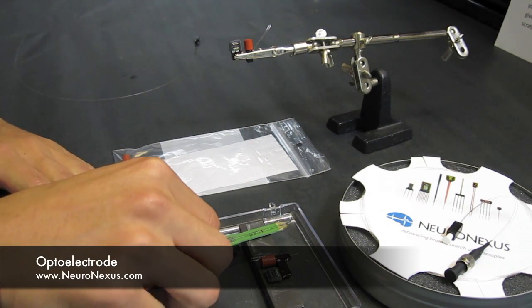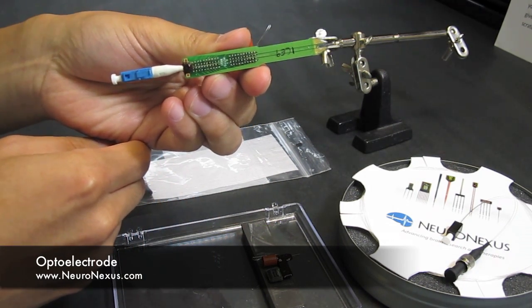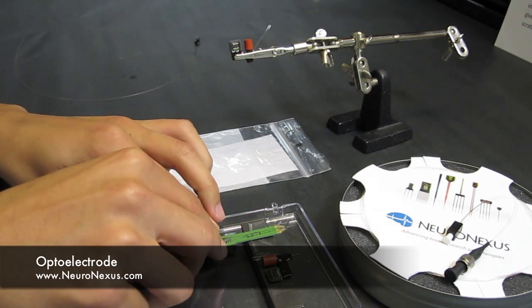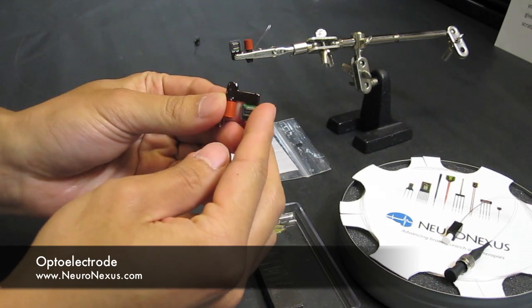Here you can see an example of an acute optoelectrode. This particular one has a 54 channel polythrode. We also have our new chronic optoelectrode.